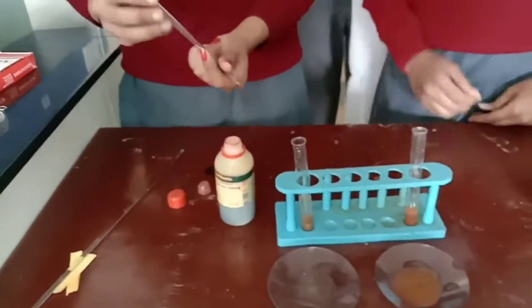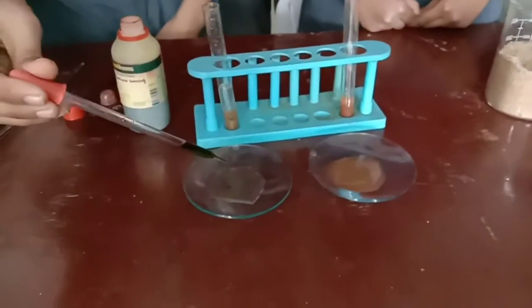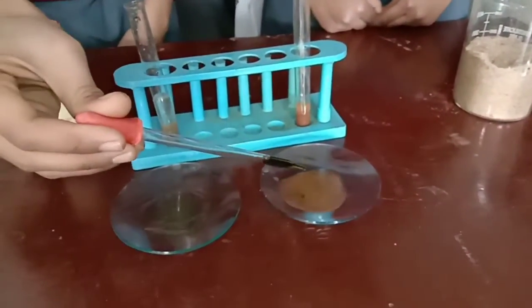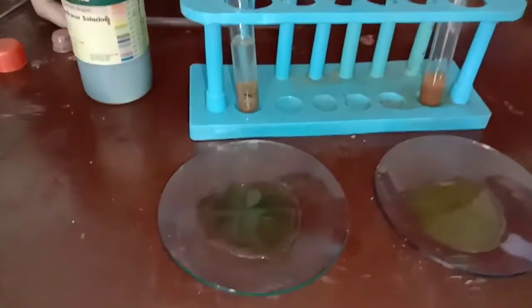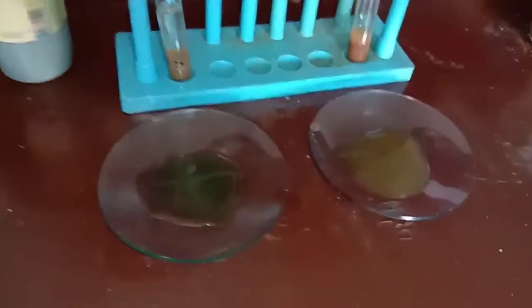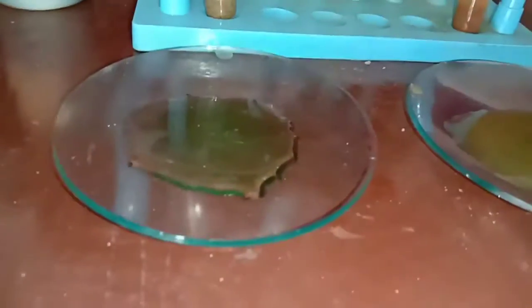With the help of a dropper, we'll add 2 to 3 drops of this pH solution into our sample which we have taken in this watch glass. Now you can see the color change in both the samples.